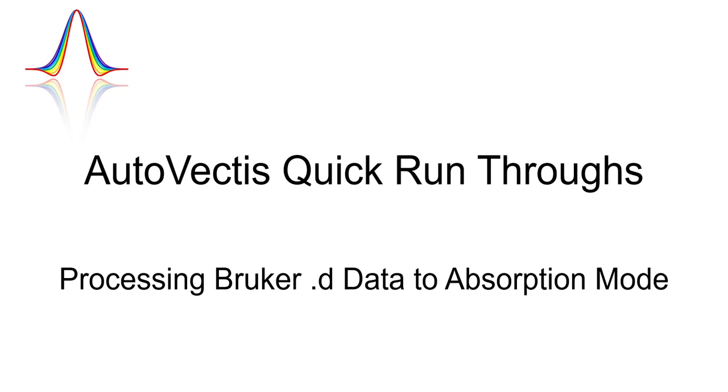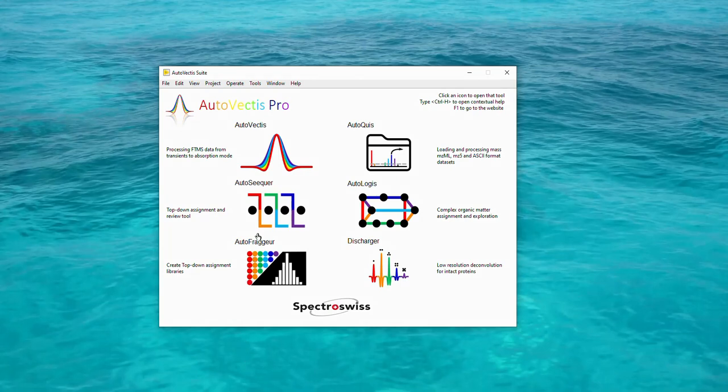In this video, I'm going to demonstrate the standard setup that you should use for processing Bruker.d files in AutoVectis. So first of all, start AutoVectis, and then in the splash screen, click the AutoVectis logo.